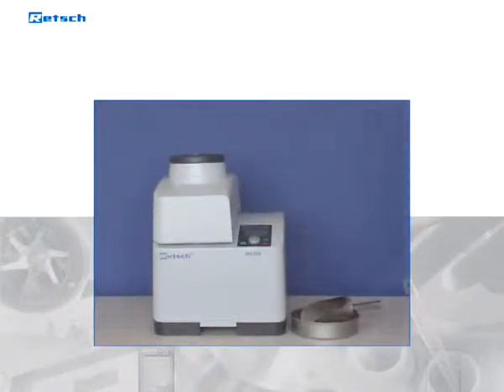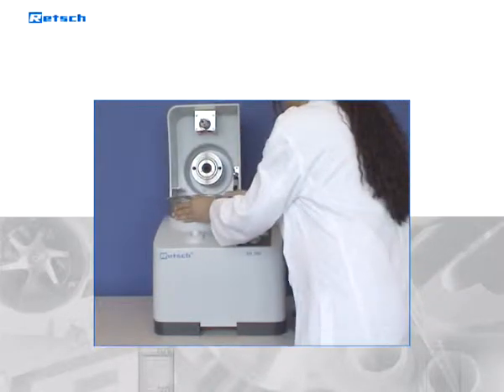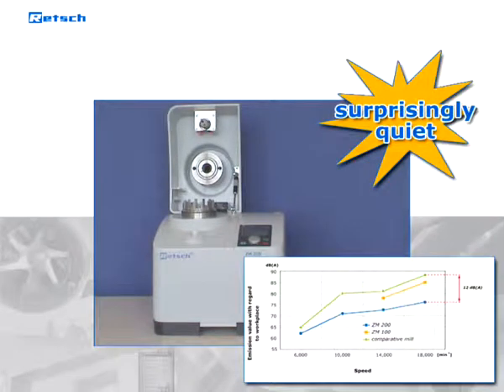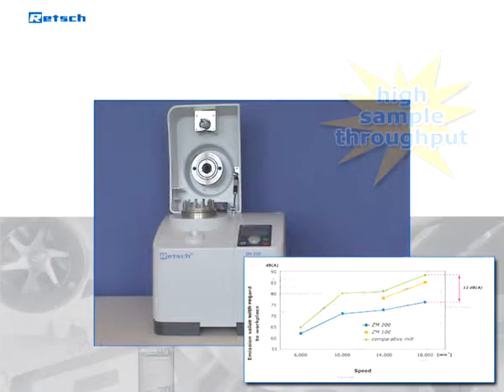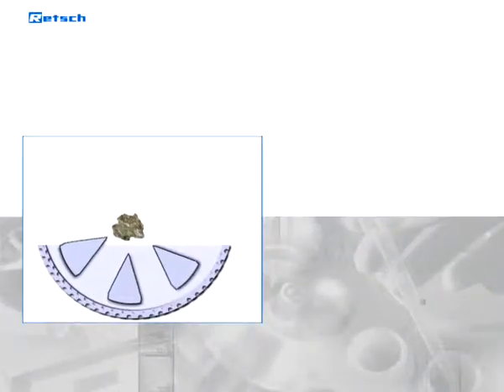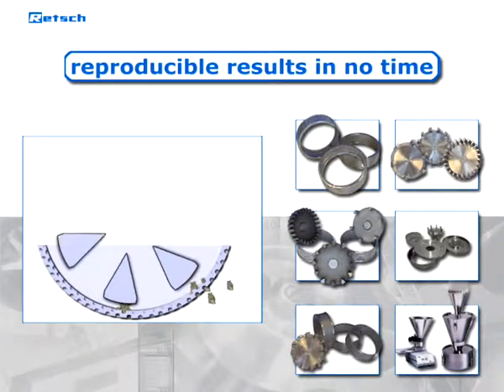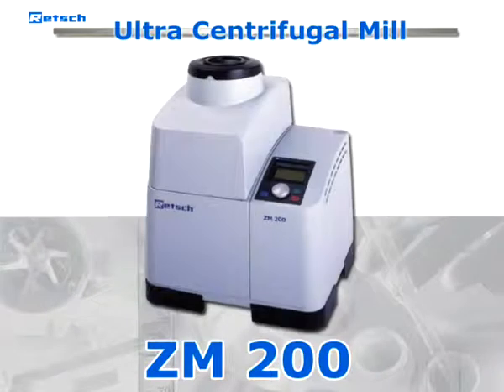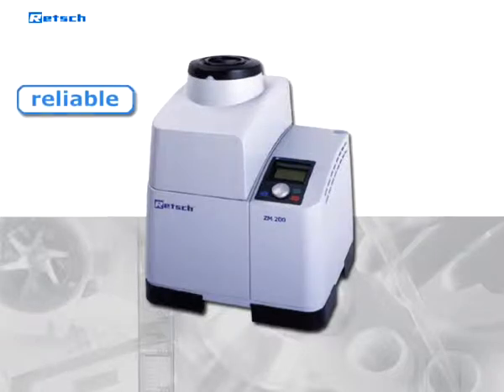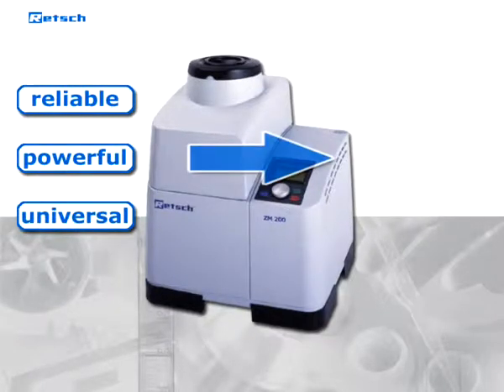The exceptional reliability and safety combined with ease of operation make the ZM200 extremely convenient to the user. This heavy-duty mill is not only surprisingly quiet, but its power drive allows for a high sample throughput. Due to the effective pulverization and the wide variety of accessories, reproducible results are obtained in no time. All these advantages make the RETCH ultra-centrifugal mill ZM200 the optimal device for reliable, powerful and universal high-speed grinding for excellent results in no time.